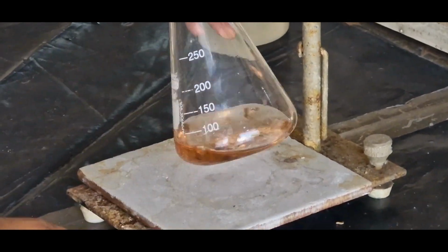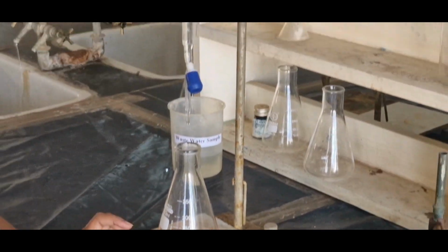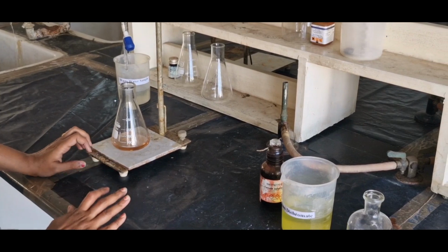So there is a color change to red. Note down this reading and repeat the same procedure 2 more times to get the concordant readings for the blank titration.